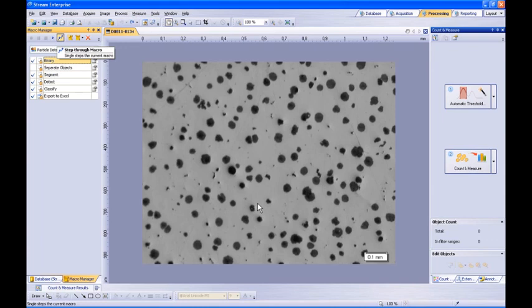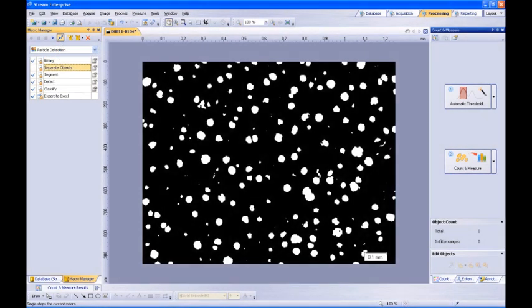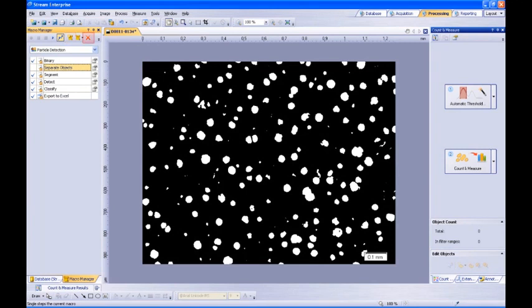Further, the user can preview the effects of each individual step of a macro at their own pace by clicking the Step Through Macro command. You can create a new macro by clicking the New Macro button or delete the selected macro by clicking the Delete Macro button. You can also toggle between macros from the drop-down menu next to the macro name where a complete list of all available macros will appear.